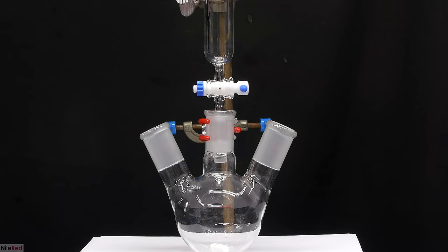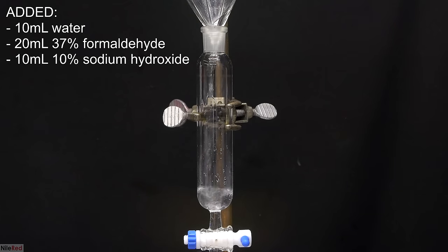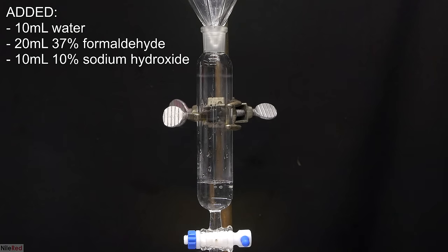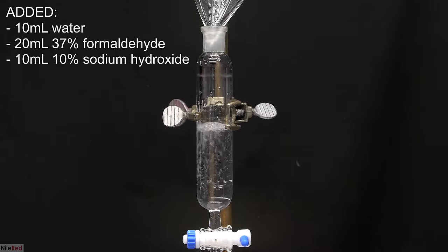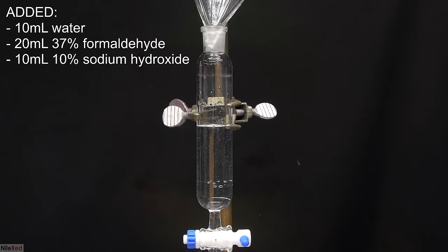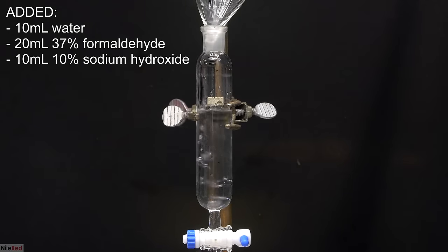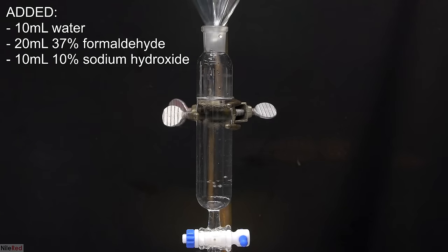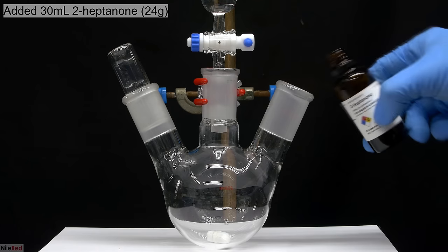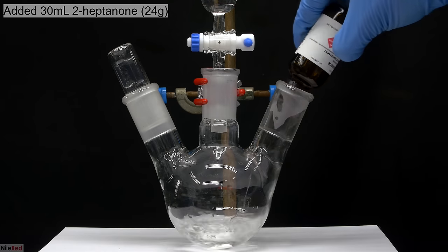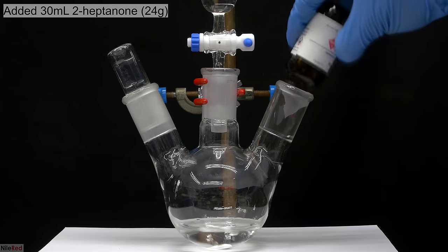For the aldol reaction and condensation, we'll need a 3-necked round-bottom flask and an addition funnel. To the addition funnel, we added 10 milliliters of 10% sodium hydroxide solution, 20 milliliters of 37% formaldehyde, and 10 milliliters of water. I added the sodium hydroxide first, followed by the formaldehyde, then the water, but the order really doesn't matter. To the round-bottom flask, I then poured in 30 milliliters of 2-heptanone, which was the entire bottle.